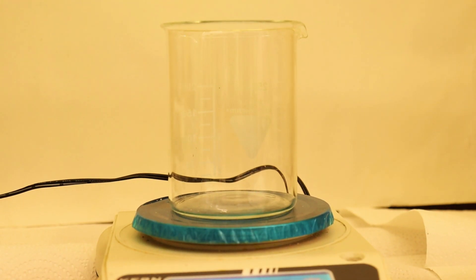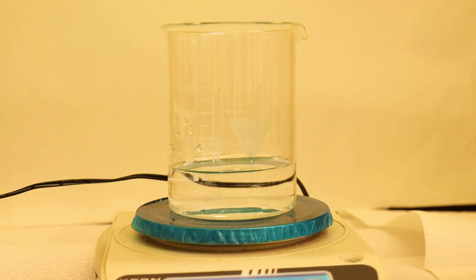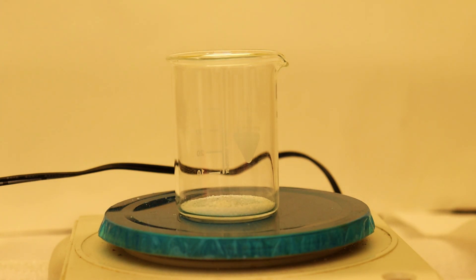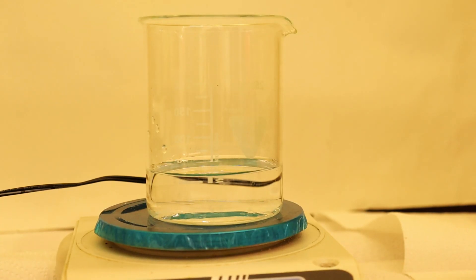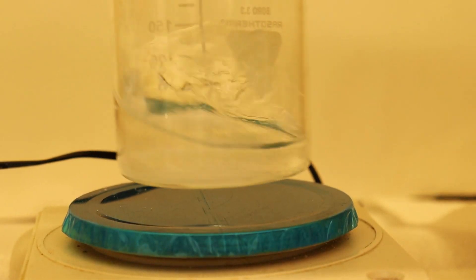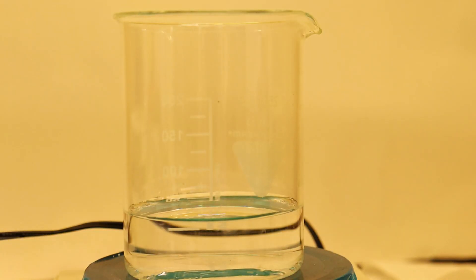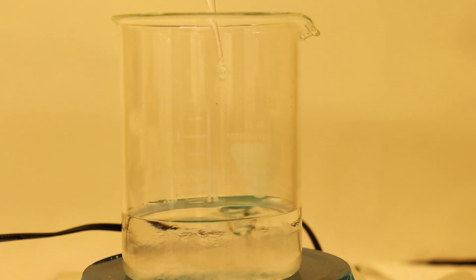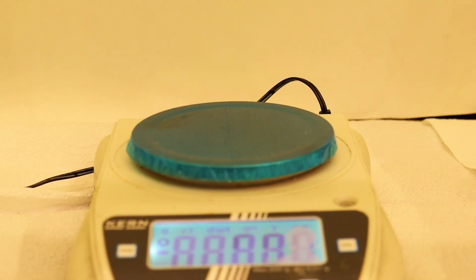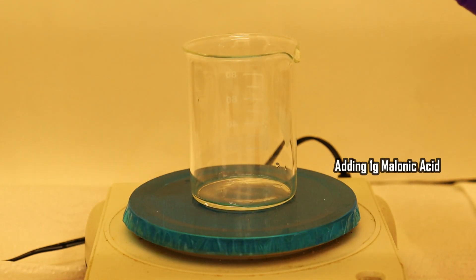There were three solutions: A, B, and C. Solution A is composed of 5 grams of bromate, 67 mL of water, and 2 mL of sulfuric acid. Next it was time to prepare solution B — it's made by dissolving 1 gram of malonic acid in 10 mL of water.